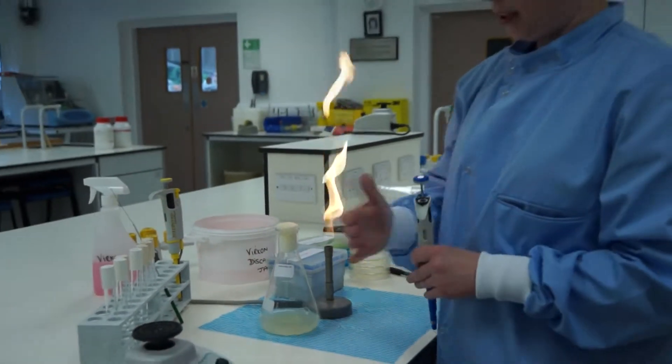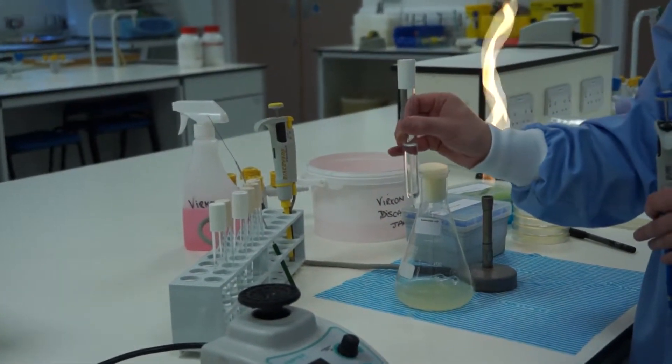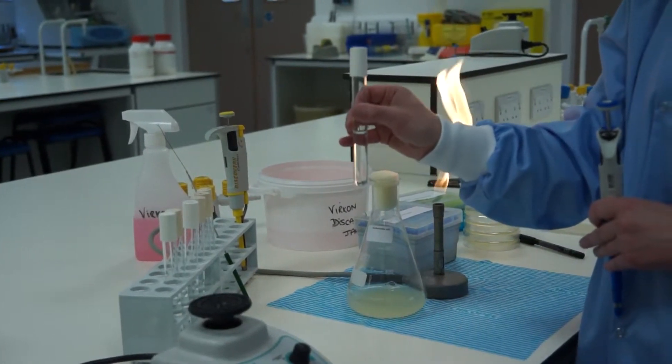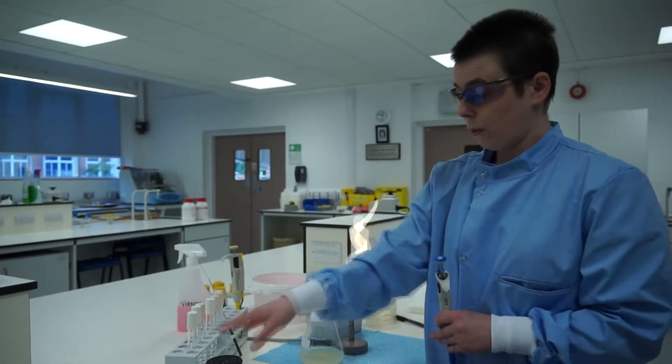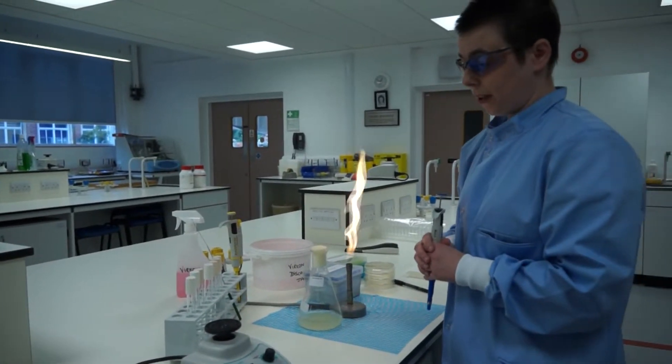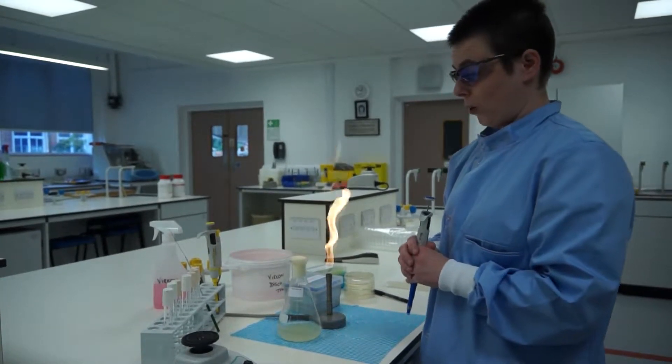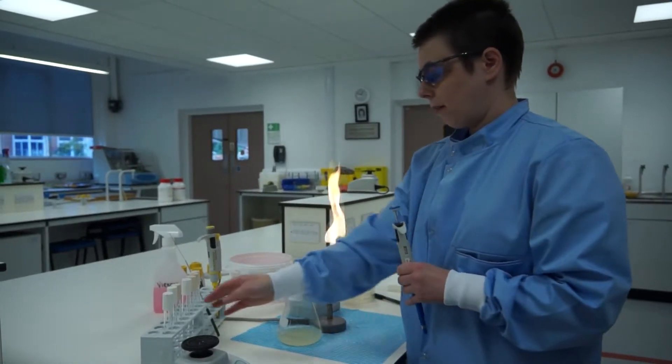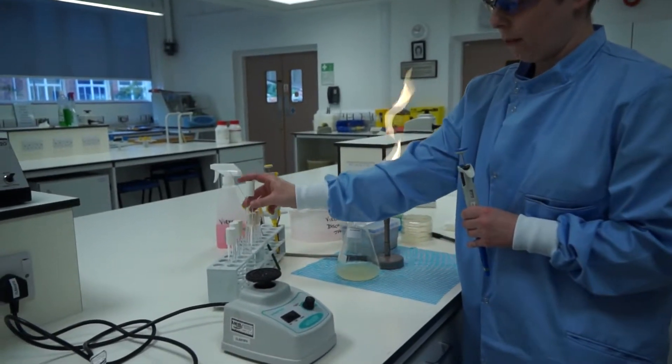The first step in the procedure is to label my tubes. I'm going to be doing 10 to the minus 7 dilutions, so I have 7 tubes and I've labelled them minus 1 to minus 7. We always label on the tube and not the cap, because tubes always go with the contents, whereas the caps can be switched. Also the tubes will wash clean when they're reused. The caps retain previous markings which can cause confusion if you're marking on the caps.